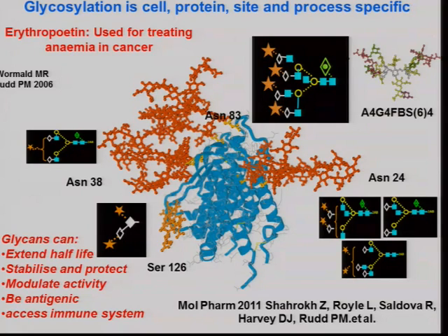And actually we're just doing some tests with Manfred Wuhrer in Leiden. I mean, provided you don't mix types of glycans, the MALDI is quite good at quantifying actually. It's only when you have neutral structures which fly better, so they're overrepresented, and you're looking at sialylated structures which probably lose sialic acid in the experiment, and you're trying to monitor them both in the same run. That's when you have problems with mass spectrometry. But if you're only going to look at neutral structures, that'll be okay.